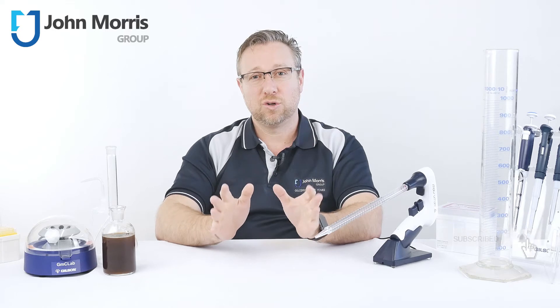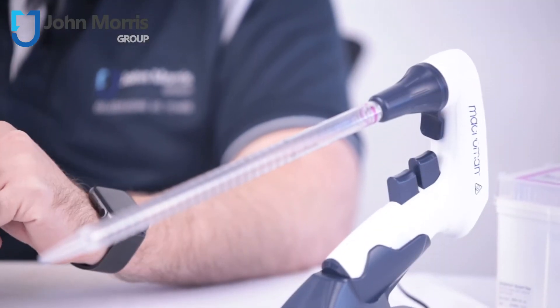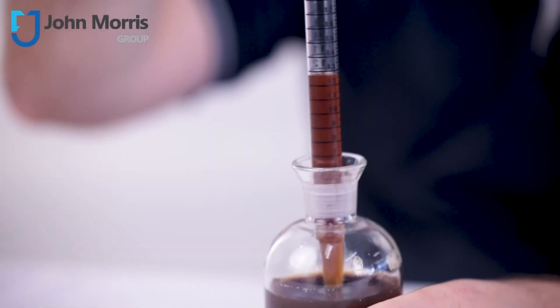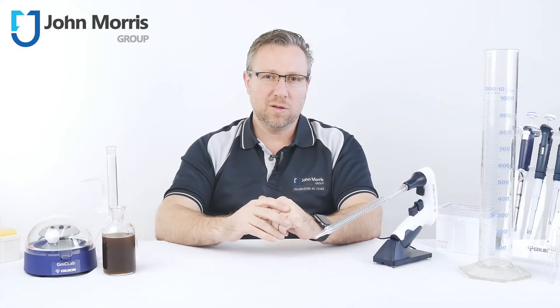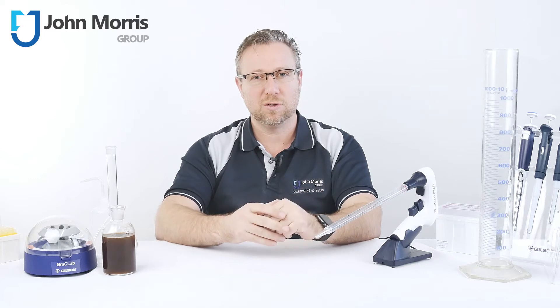Today we're talking about electronic pipette controllers. These handy tools allow you to safely and accurately aspirate and dispense liquid volumes between 0.1 to 100 mils via a seriological pipette. They're commonly used in applications such as cell culture, microbiology and biochemistry, to name a few.